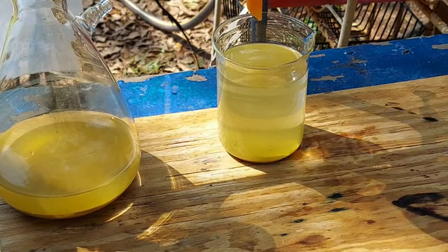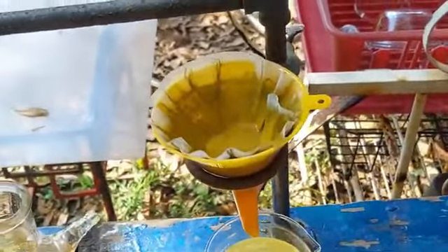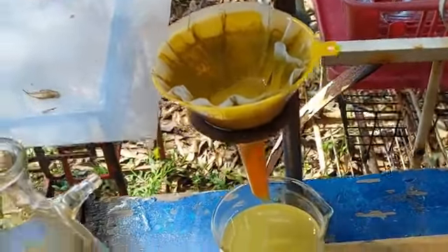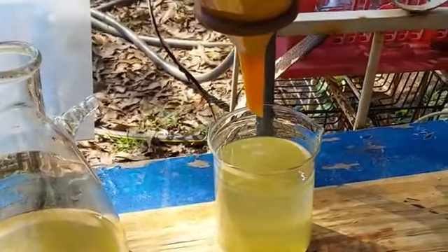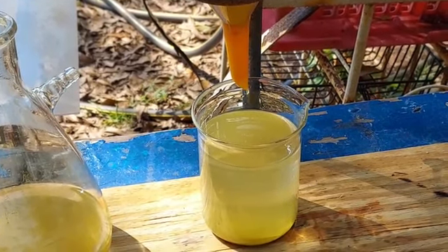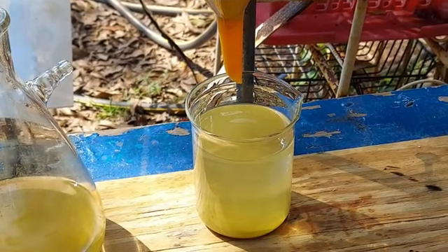Filtering this stuff is a goddamn nightmare. That is right up there with barium sulfate in being a complete pain in the ass. I started filtering this yesterday. The filter paper had to sit overnight so that it would be impregnated with this, and then I filtered it today. And then I added a little bit too much beyond the filter paper that had been treated yesterday, and it came through. Anyway, so now I have to do this again. I swear to God, filtering this is a bitch.